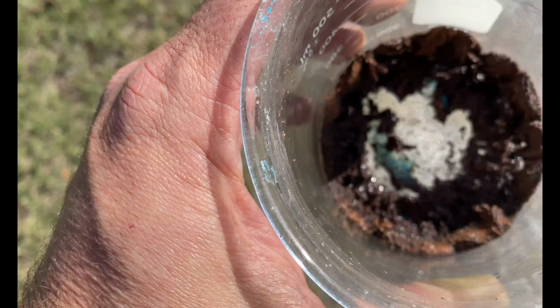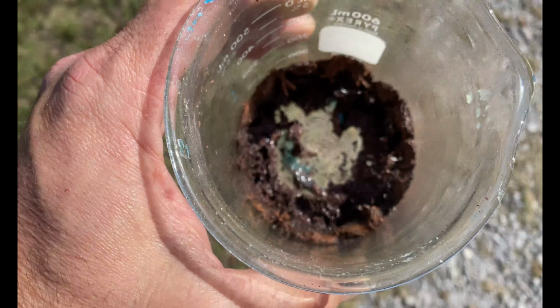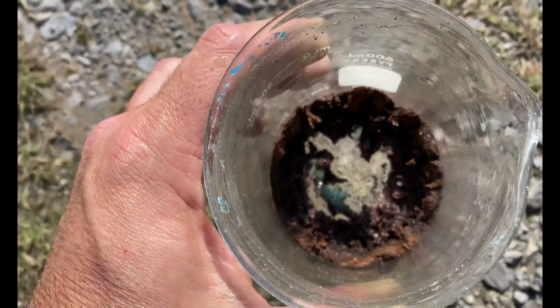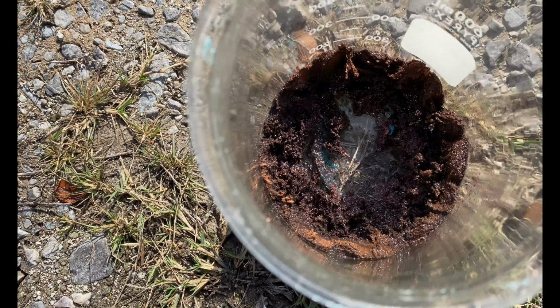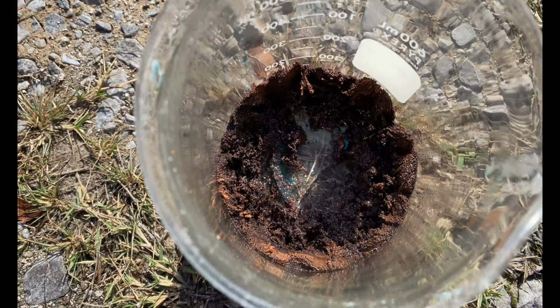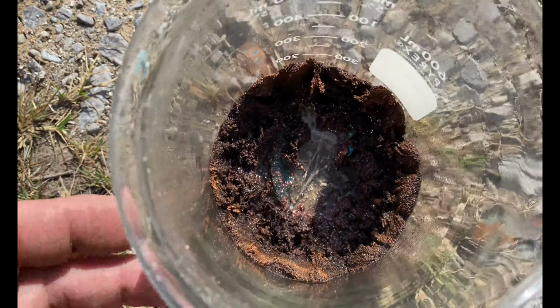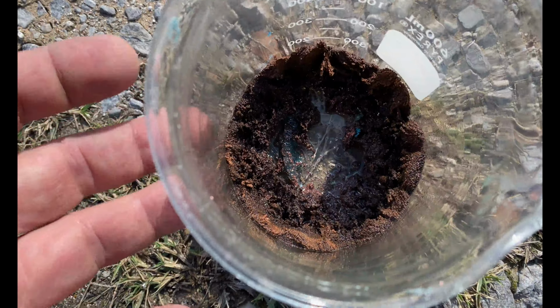Okay, so I think the repeated rinsings was a bad idea. It started to weaken the mixture, and I think what happens when it's diluted like that, when it's diluted and you do multiple rinsings, instead of doing the strong reaction where iron swaps position with copper, it sort of just started oxidizing it. And so we were getting a lot of black particles, and instead of being blue or green vitriol, it just started to turn black.